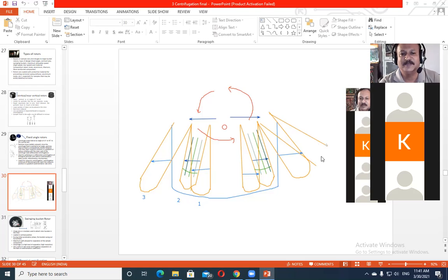See, if it was a vertical tube, then the particles would go to the wall of the tube, isn't it? And then as we increase the angle from 0 degrees, the particles are going more towards the bottom of the tube. Do you understand what I'm saying?